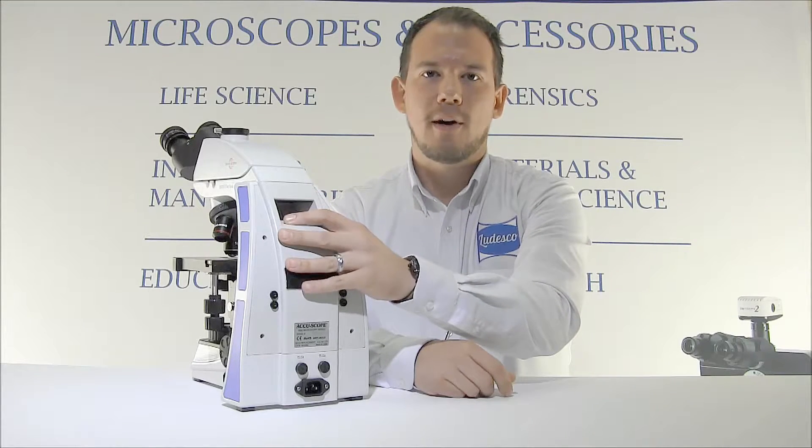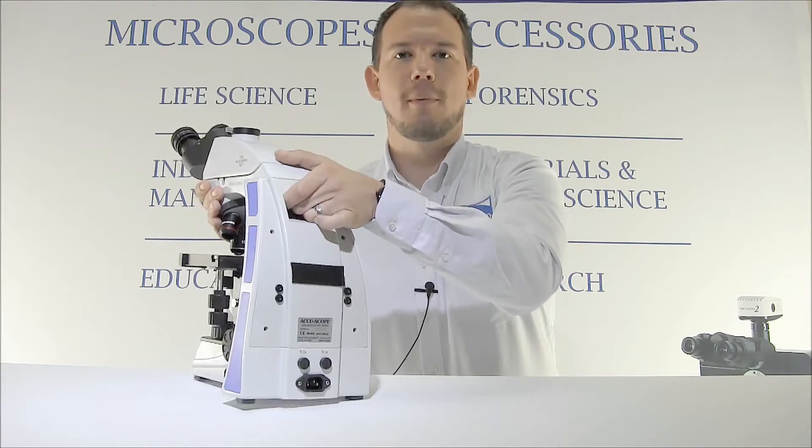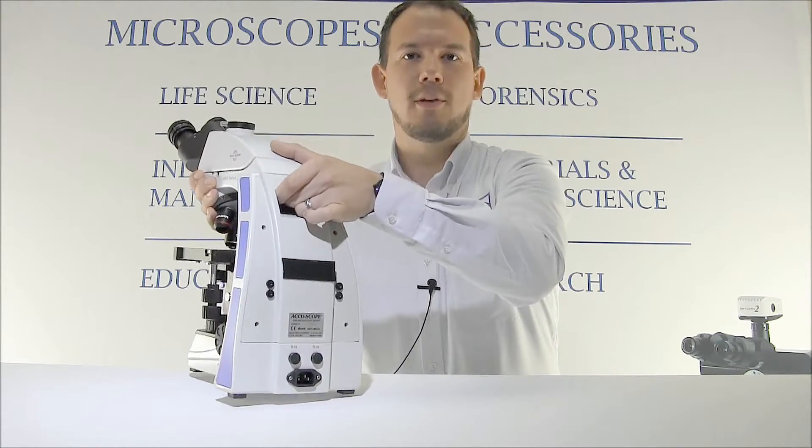The 3000 LED also has an integrated handle in the back of the microscope. This allows you to get a very secure grip on the microscope to lift and transport it to the next location.